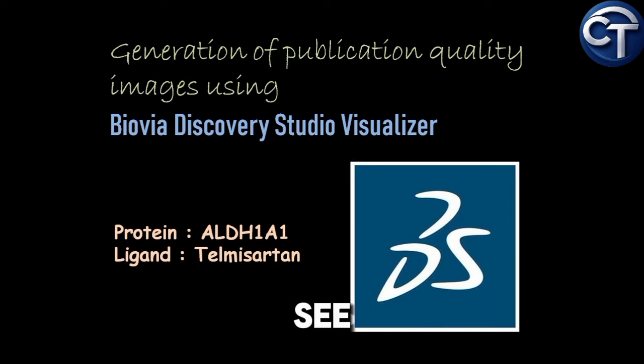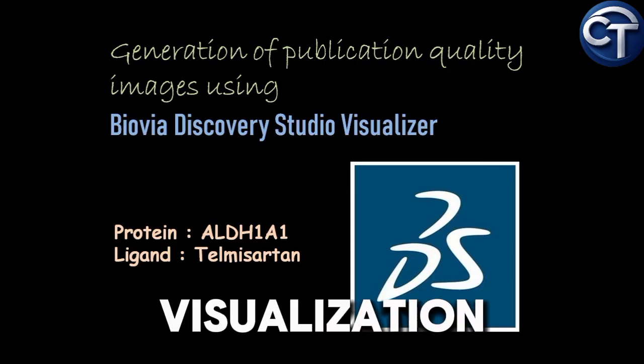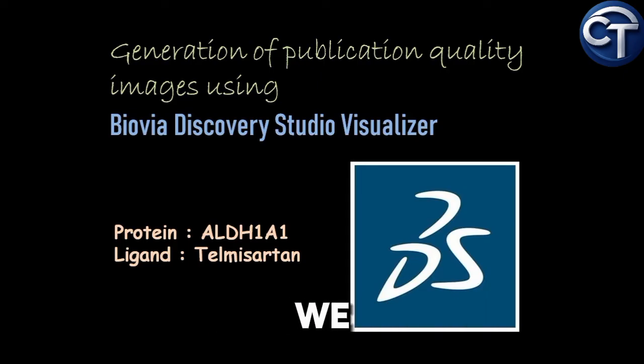Now, to see the interaction of the docked poses within the site pocket or binding site of the protein molecule, we need to open it in different visualization software where we can explore the interaction and generate publication quality images. So in this video, I am going to use BIOVIA Discovery Studio, and first of all, I am going to download it from the website and install it on my laptop.